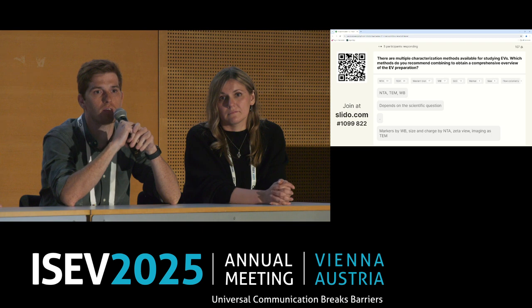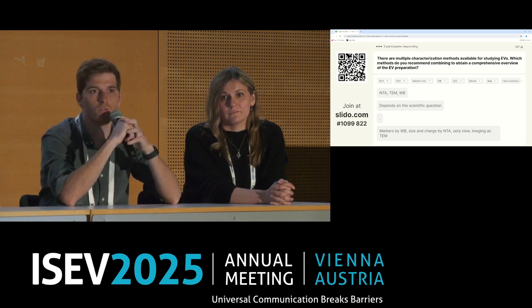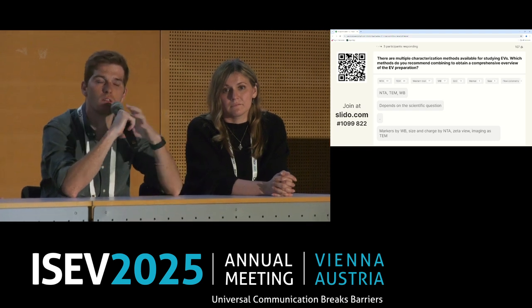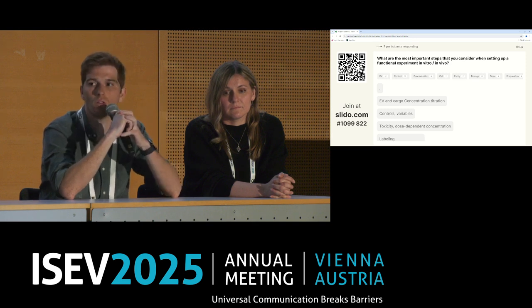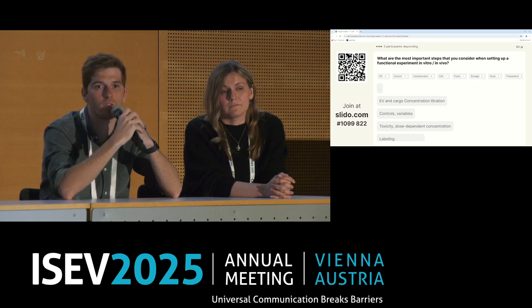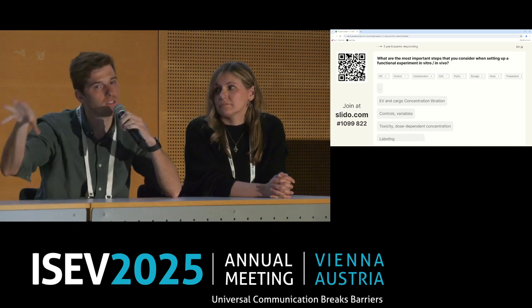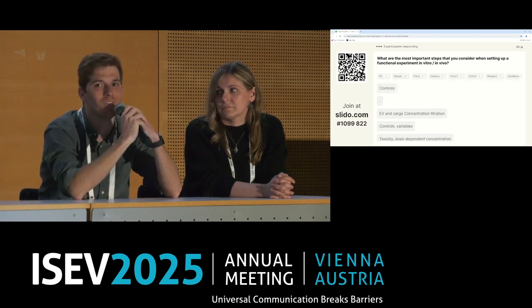A lot of the time it has something to do with whether you have the proper controls and your experimental setup is well designed. If not, look at the application, how we did everything, and then sometimes that can also lead to a solid conclusion. But of course, that's why we always use orthogonal, complementary characterization methods. In the end, if one says no and the other one says yes, if you have the third one, usually that allows you to have something in between.